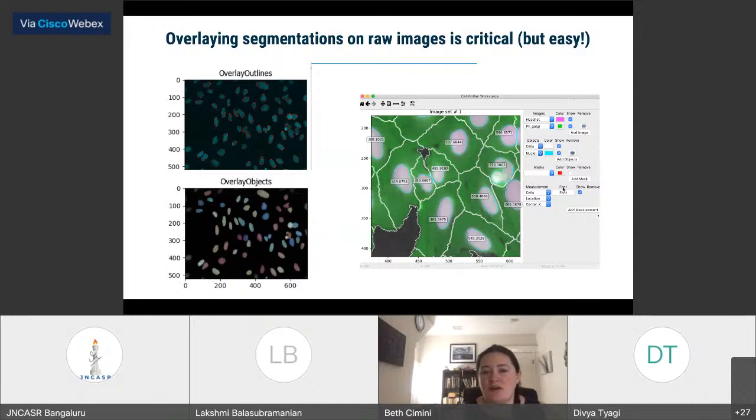One of the nice things with the Workspace Viewer is, unlike the CellProfiler module windows, which will default to being all the way zoomed out every time you change a setting, the Workspace Viewer will stay docked and zoomed in on a particular area. So if you're iteratively trying to change a few settings to handle a tricky area of segmentation in one part of your image, the Workspace Viewer makes it really easy to do that.